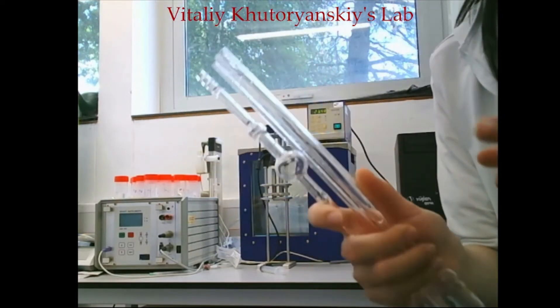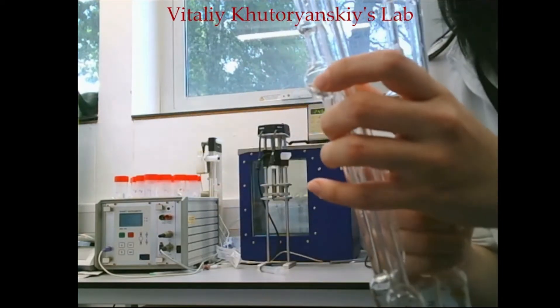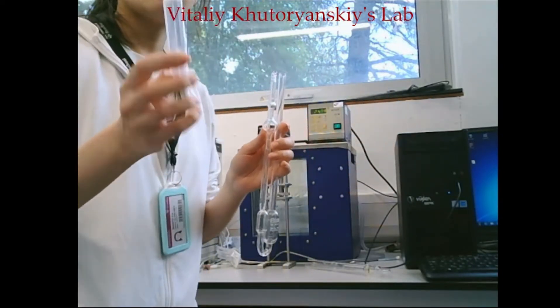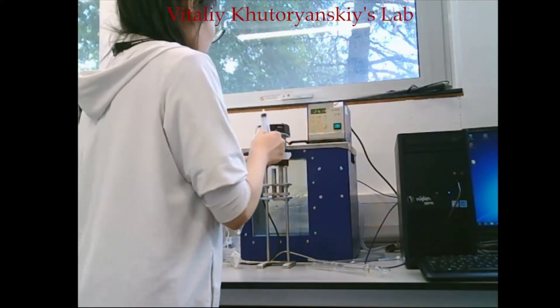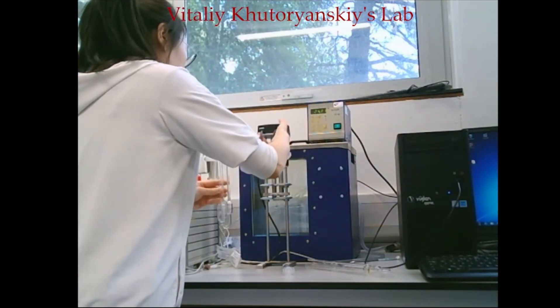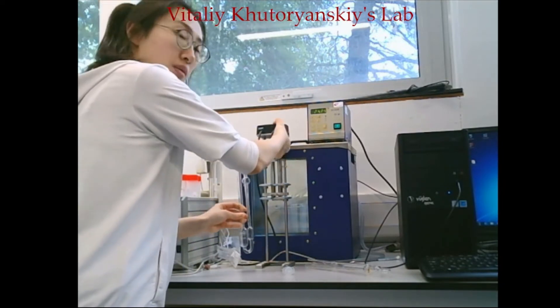Next we are going to load the liquid into the IC type capillary. I'm going to use a syringe to load in the liquid, which is more convenient. Hold the capillary, use one finger on the inside, and push it so it goes in.